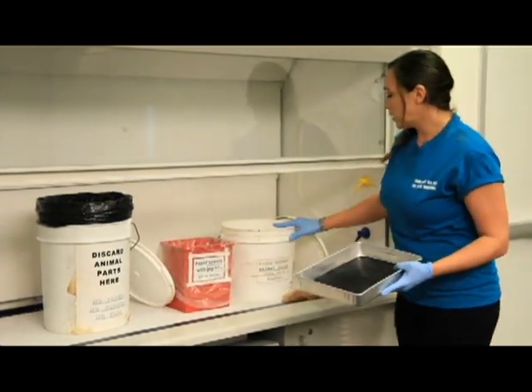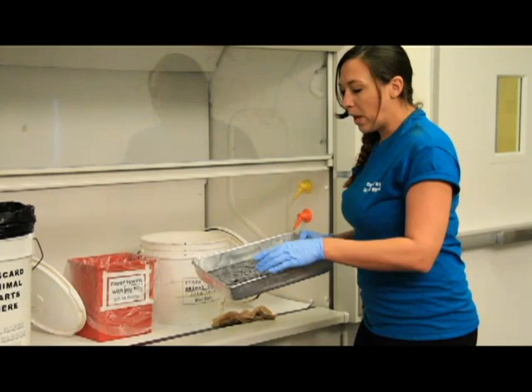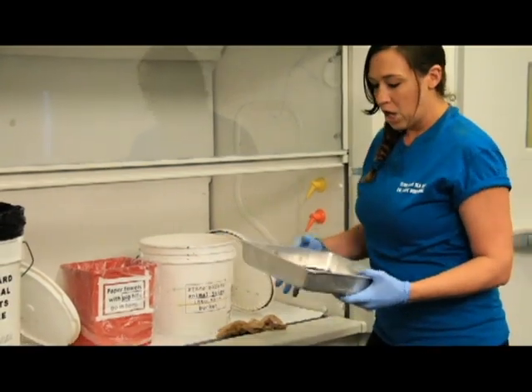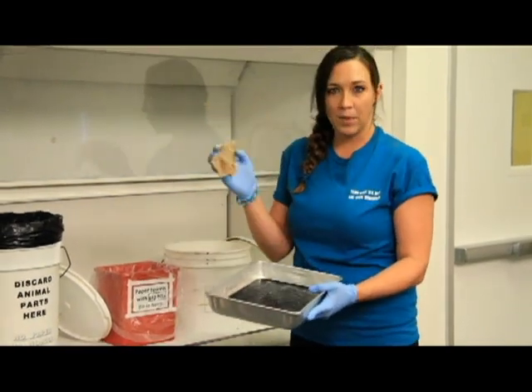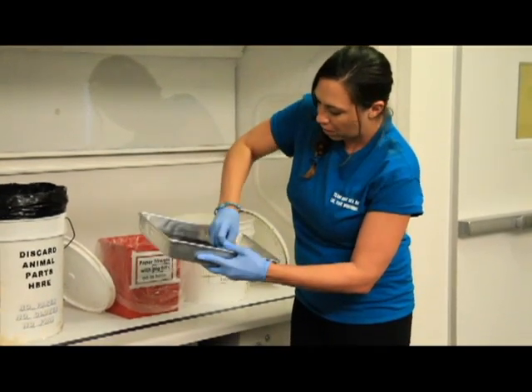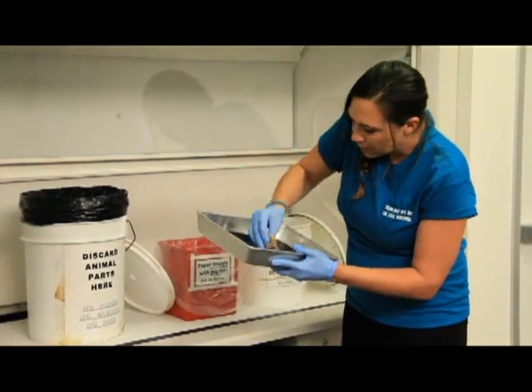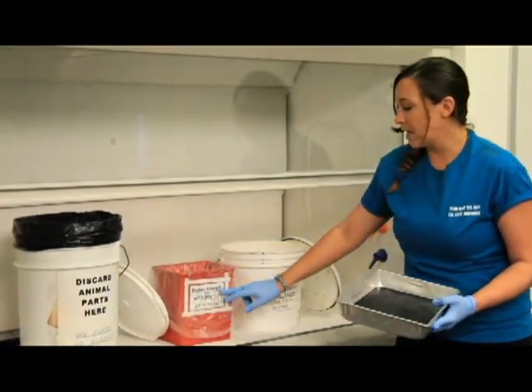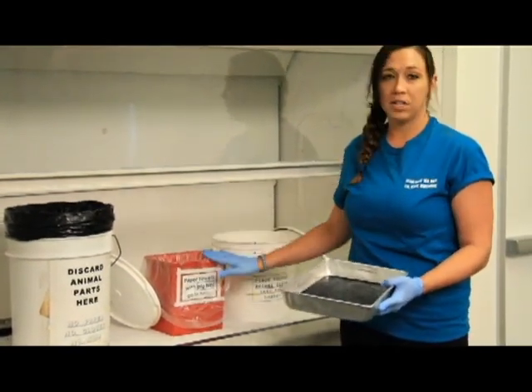The next bucket is the place for excess animal juices, and this is that first bucket that we poured the liquid into. So any excess liquid that we have, we're going to pour into this bucket, not down the sink. Then we have a tray with very, very small, tiny pieces on it that we can't pick up. So you're going to take another dampened paper towel and scrape, and scrape and scrape and get absolutely all the tiny little things off of it, so that any little thing that I can see gets picked up in this paper towel. Then the paper towel with pig bits only goes in the bin that says paper towel with pig bits in it. Any other paper towel that you have used can just go in the regular trash, but if it has pig bits on it, it has to go in this red bin.